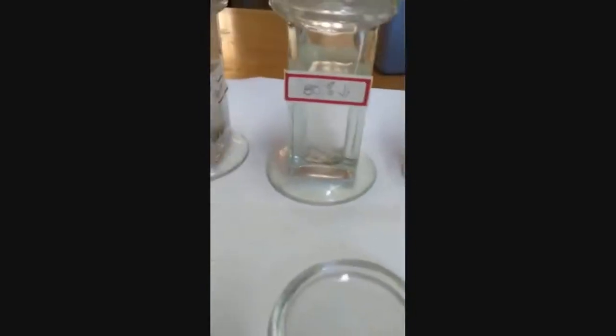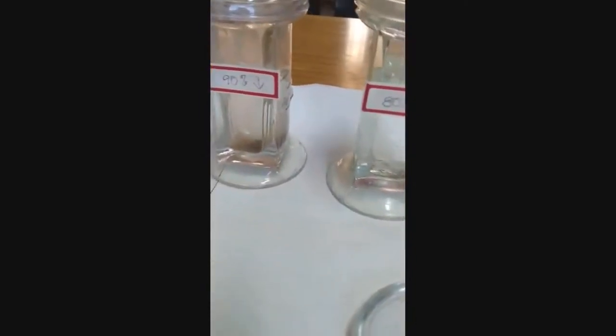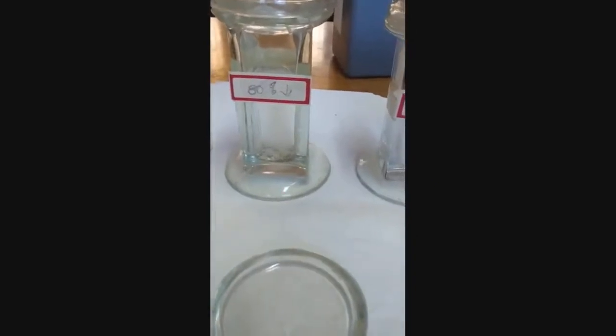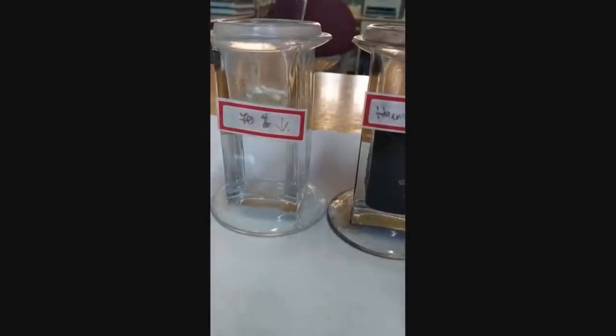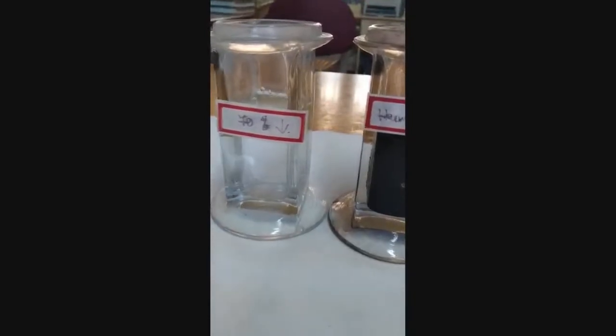This is to hydrate the tissue or to increase the water content of the tissue. We have to leave the slide in each grade for about 5 to 7 minutes. After processing the slide in 70% alcohol, we have to stain it.